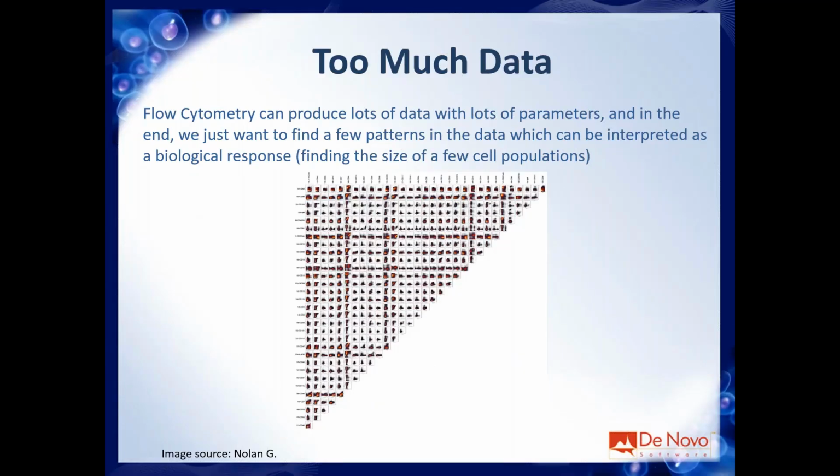Well, basically because of the same reason we need any other type of high-dimensional data analysis tool, because we have data sets that contain more and more parameters every day, and the standard way of analyzing them, so multiple 2D plots and multiple nested gates, is not really efficient. It's fine if you have clear in mind a specific population, your target population of interest, but if you want to have a comprehensive view of what's inside your FCS file, you really need something different. And SPADE is a good example. Or, for example, 2 weeks ago, we did a webinar on tSNE. So those are all different approaches.